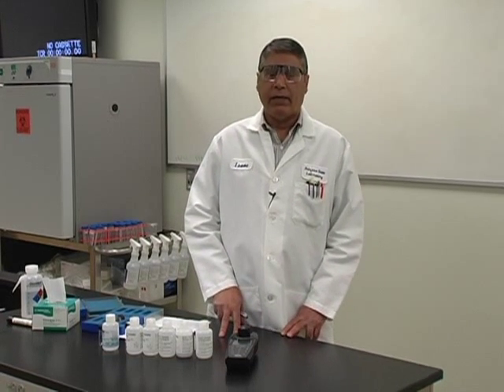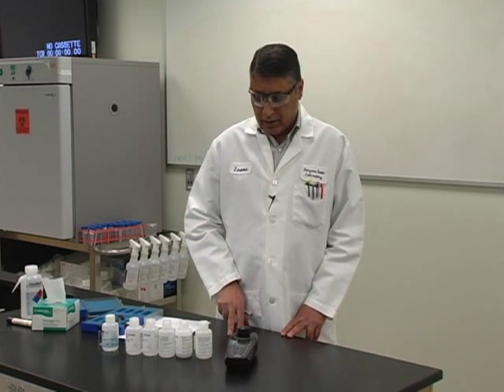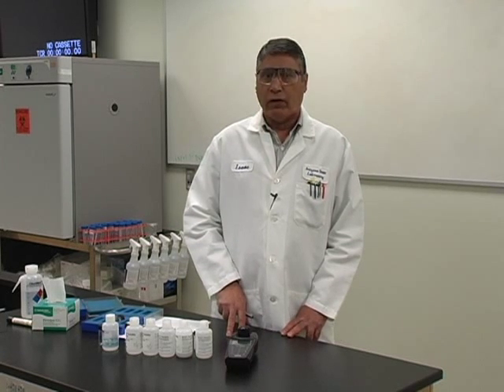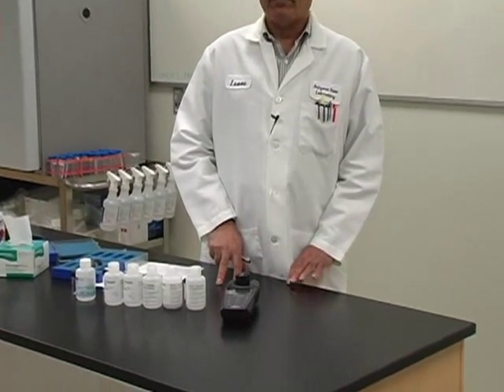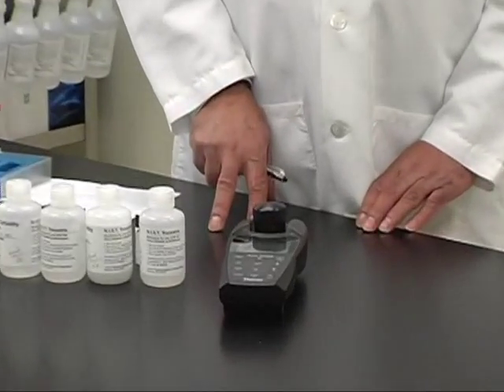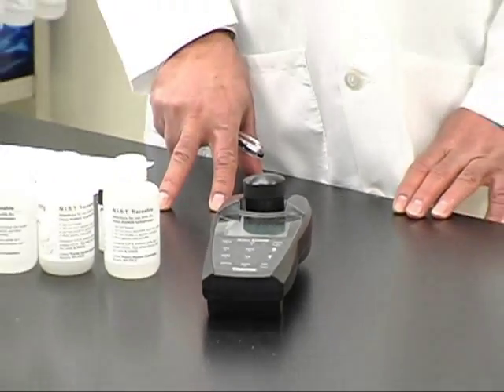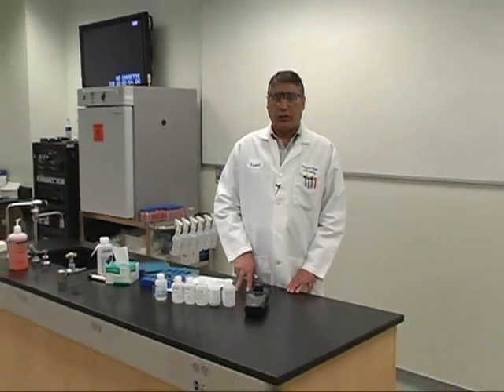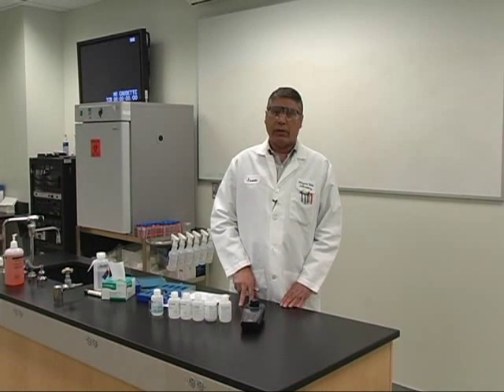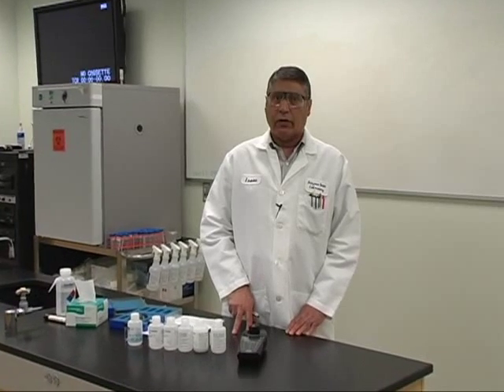Here at the state laboratory, we are using EPA method 180.1 and an Orion AQ 4500 turbidity meter. There are different meters out in the field — some meters require only one standard for calibration, some require two. Each plant will follow whatever the manufacturer's recommendation standards are for calibration.